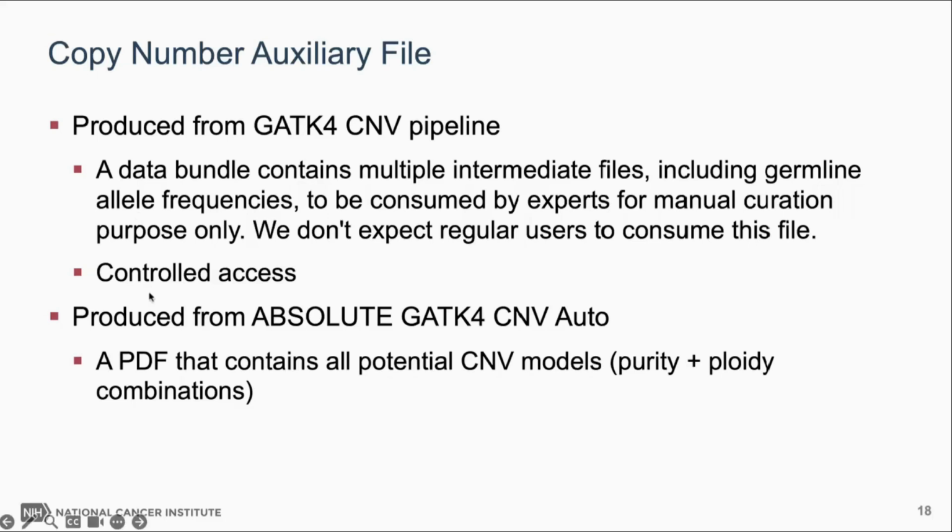So then this is also produced from ABSOLUTE GATK4 CNV Auto, and this is a PDF that contains all the potential CNV models so that they can also be analyzed.